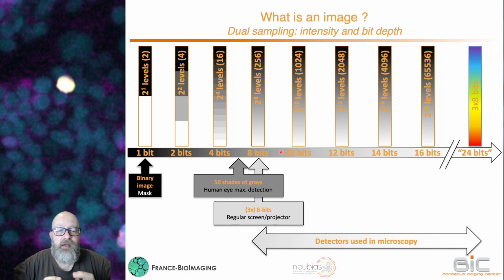In fact, the way to handle color images on a computer, we've got two ways. The way you've been using, because you've been acquiring color images, you've been in fact acquiring 3 different images seen through 3 different filters, a red, a green, and a blue, which mimics a bit the way your eye is actually working.